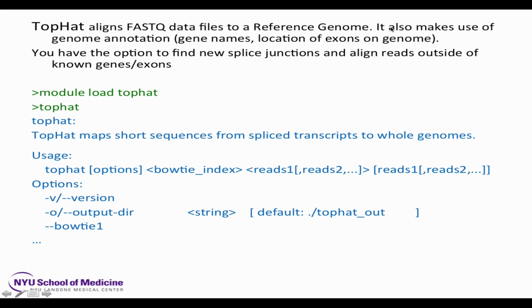So again, this is showing the command line version. In a second, I'm going to show you an SGE script. Then I'm going to take a little break and have you actually type this and try and run it yourself and generate the whole world of possible errors so that you can get a little handle on how you troubleshoot.